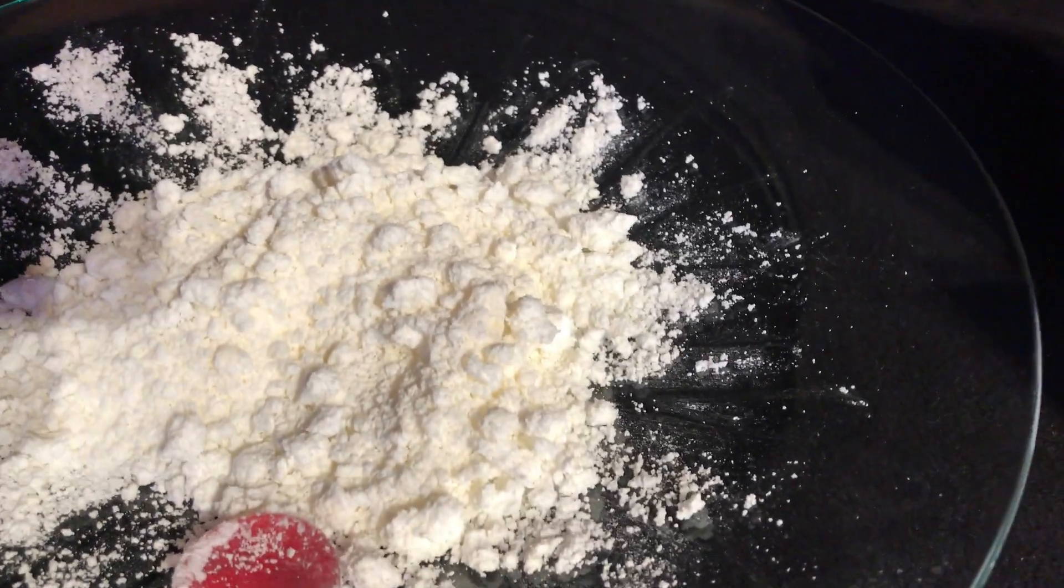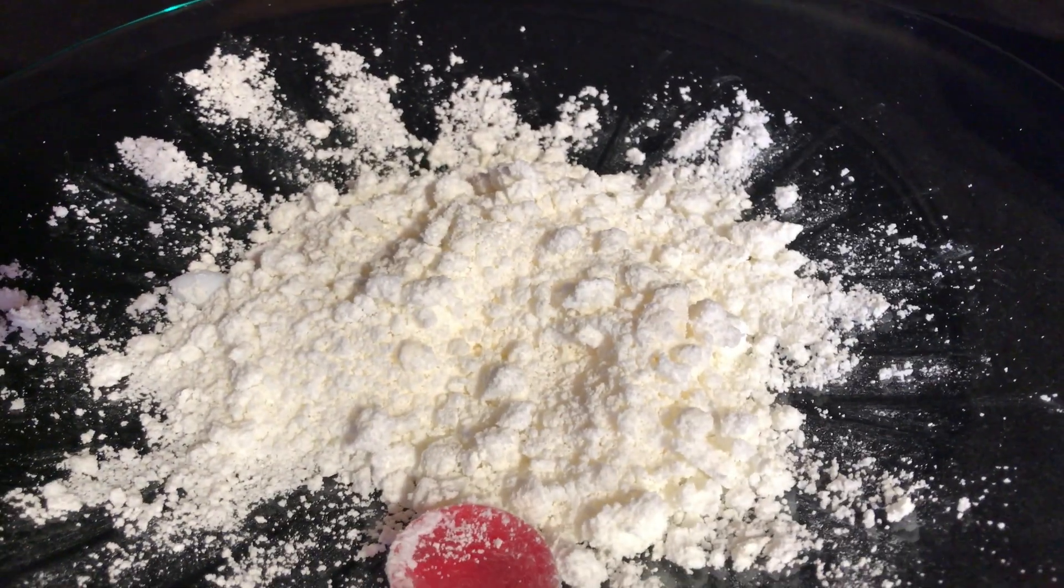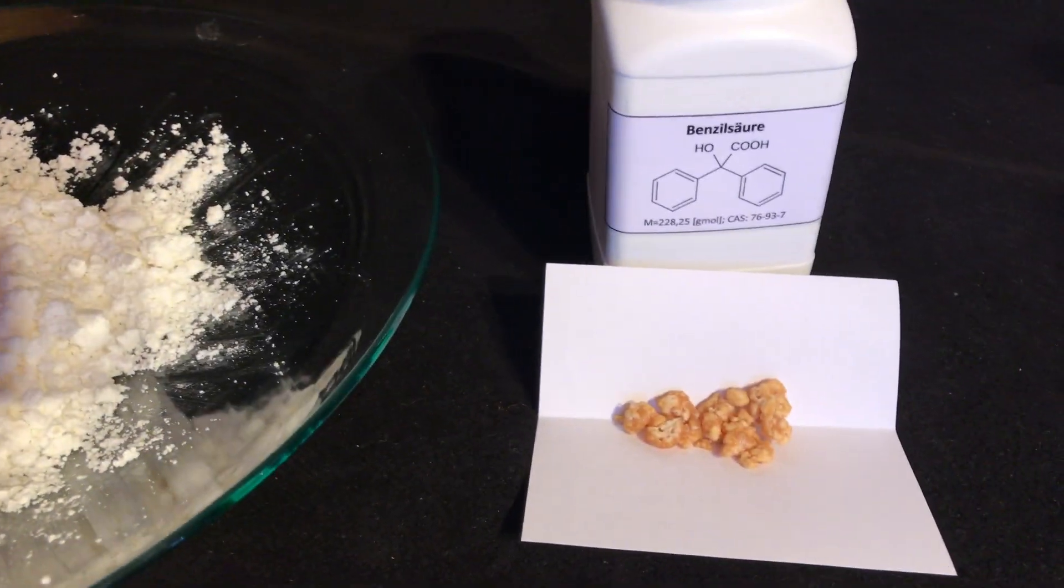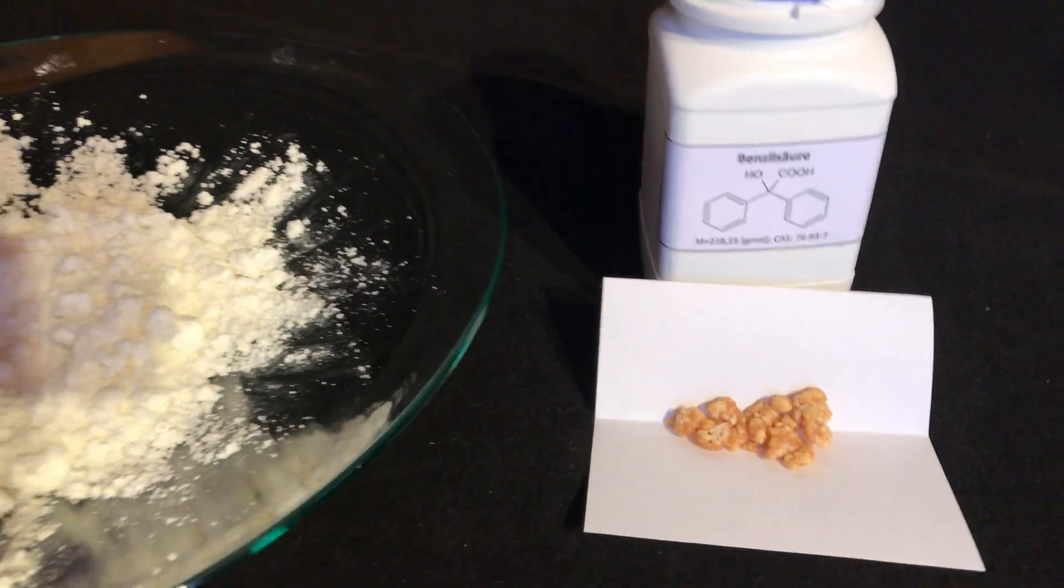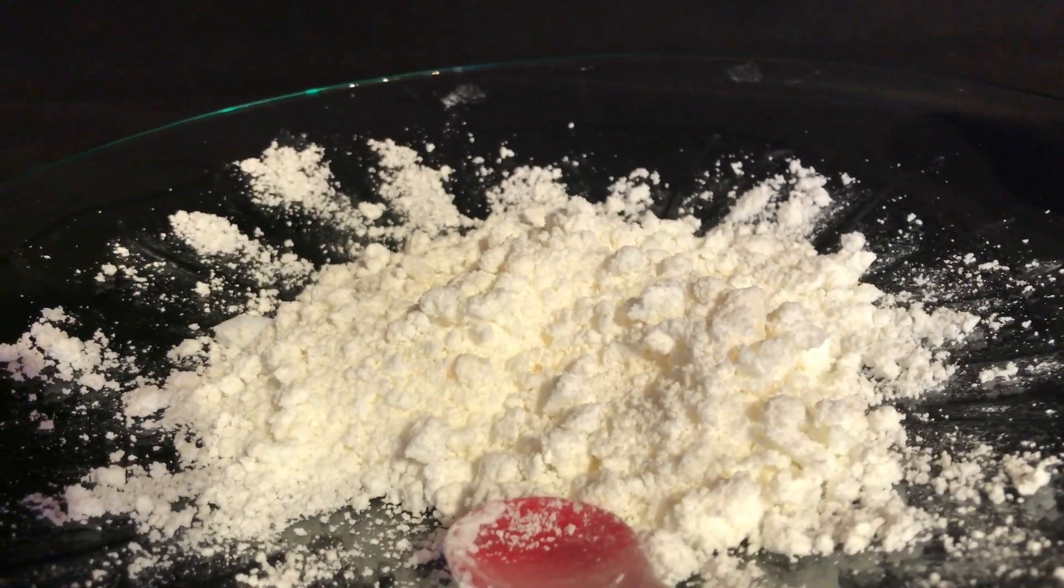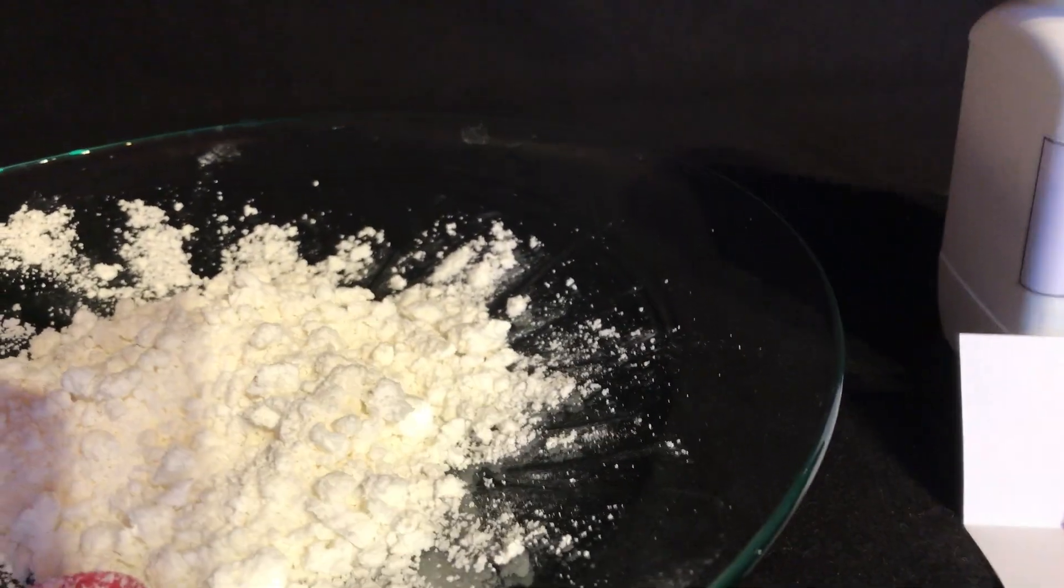Today I'm going to show you two methods to make benzilic acid. One is the classic method using benzil, and the second uses benzoin and potassium bromate. Do not repeat anything you see here at home because I'm using dangerous reagents and I don't want you to get hurt.